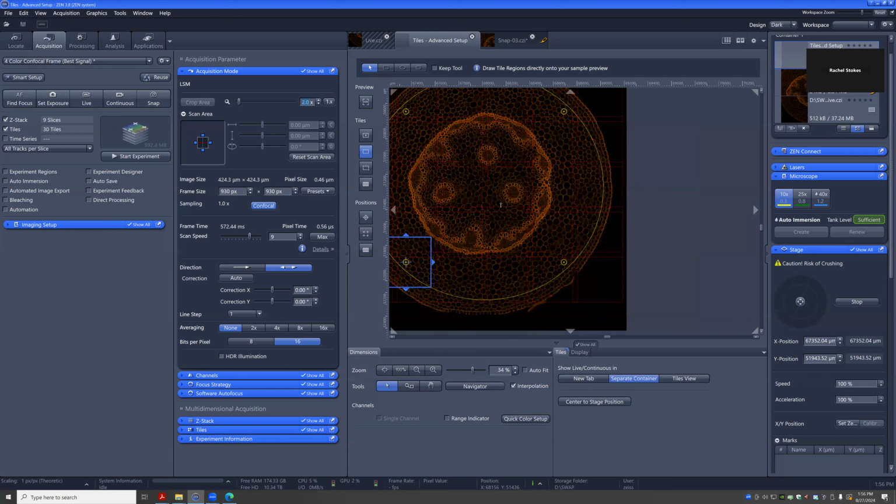If I'm grabbing a larger area, it's going to take way longer to scan. And if it's taking too long, I'm going to up the speed, but that also means I'm getting less signal to noise. So you scan a smaller area, you zoom up, you can slow down the speed, get as many pixels as you can, and get the best possible image without it taking forever.